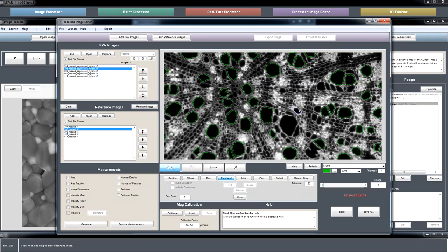The region grow tool at the moment has a bug, which some of you may have caught, that is already fixed for beta 7. It's basically like a magic wand tool in Photoshop, where you click on a feature and say fill, and based on the pixel value that you clicked and your tolerance value, it will automatically select similar pixels surrounding it.